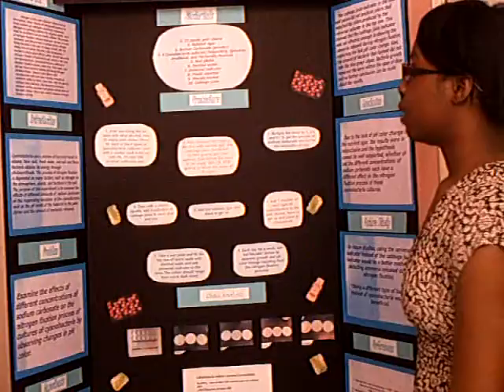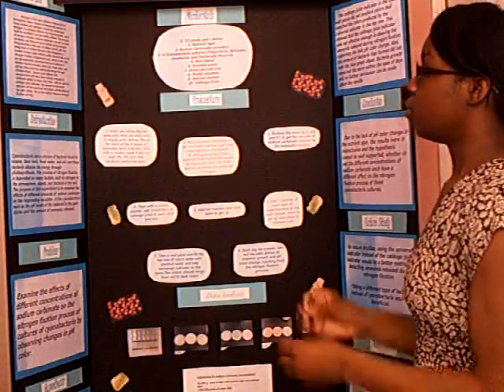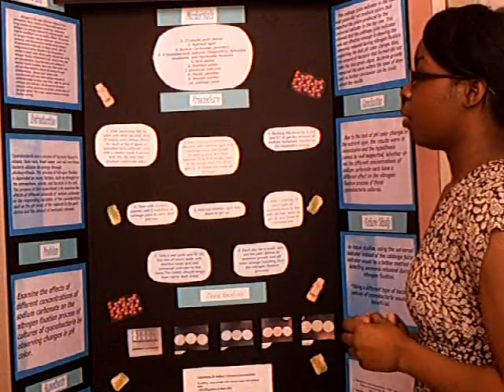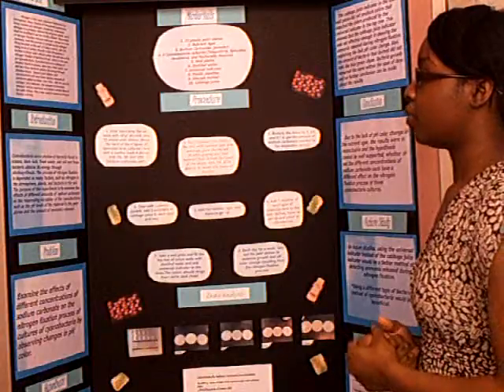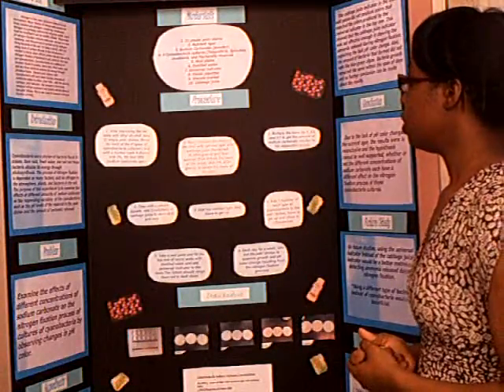So the first thing I did was I got 12 empty petri dishes, three for each of the 4 types of cyanobacteria cultures. And with the marker, I marked 4 dishes with 0%, 5%, and 10%, which was the amount of sodium carbonate.